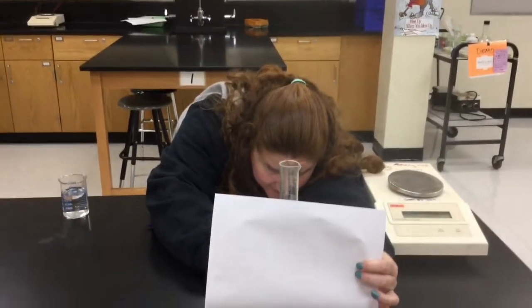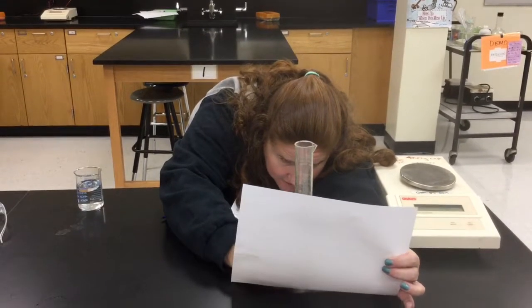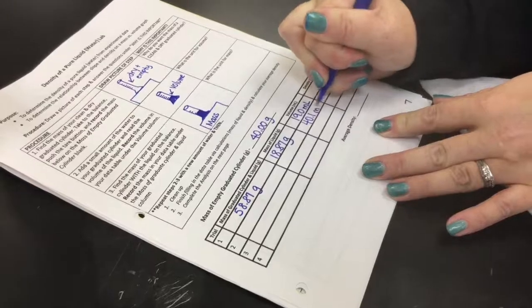So she's focused right now. I'm very focused. Oh, is it on 40? Yes, it is. Okay. I'm gonna say it's 40.1. Okay. All right. 40.1. It's a little bit above the line. So, volume 40.1 milliliters.